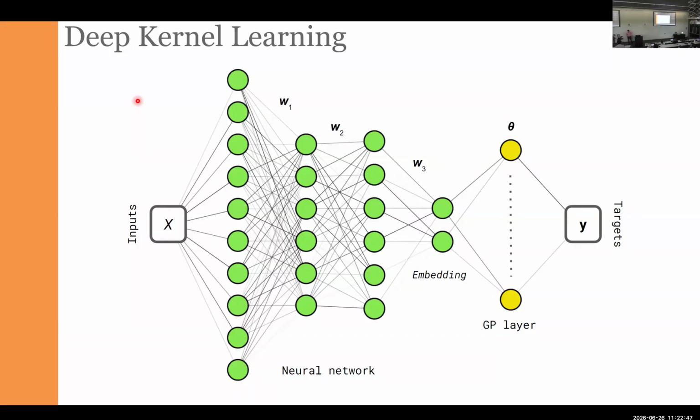But for an ideal microscope and a fully unknown sample, rectangular sampling is optimal. Rectangular sampling becomes non-optimal for cases when we have a complex scanner, like a small scanner that can act over some part of the image, and a bigger scanner that can work over a different part of the image. It becomes non-optimal if we know something about the image in advance, like using a low resolution scan in order to create a high resolution scan. Then we can do better. But if we don't know anything about the image, the rectangular scanner is optimal.